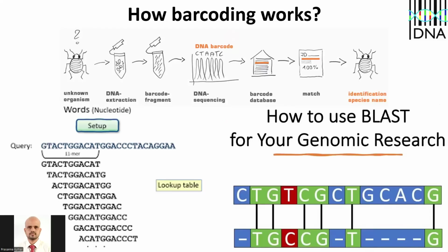So what is this barcoding and how does it work? Once I have a database full of DNA barcodes, decoding the local diversity becomes possible. Say I have a barcoded beetle A species and I have deposited the sequence. Now I can sample this unknown beetle and extract the DNA. I can go for PCR amplification, get this chromatogram, and match the sequence with the database. Now I know the beetle species.